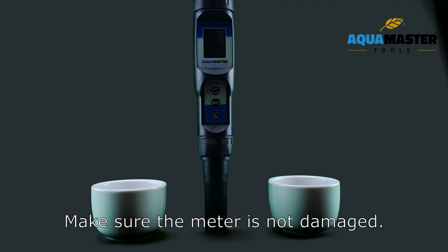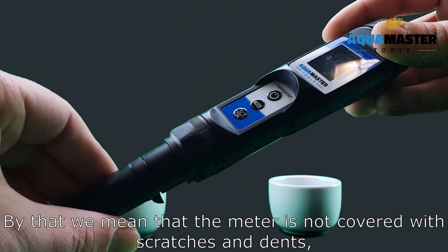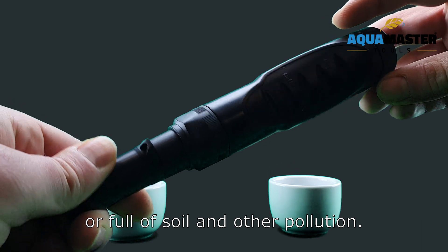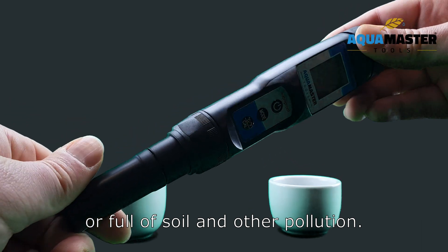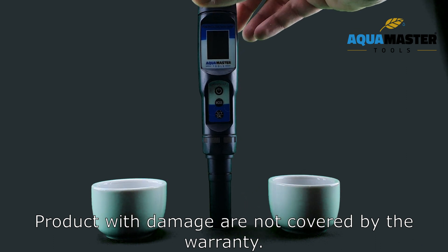Make sure the meter is not damaged. By that we mean that the meter is not covered with scratches, dents, or soil and oil pollution. Products with damage are not covered by the warranty.